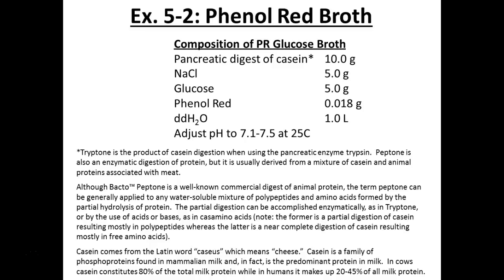Why would we want to digest it for our bacteria ahead of time? Break up the molecules, make them smaller. Right, they're going to eat quicker, right? Why do we grind up baby's food? So they can eat it quicker, right. If you gave a baby a carrot, they have no teeth. They'd be sucking on that all day, right? We want them to grow fast, so we basically give them baby food.